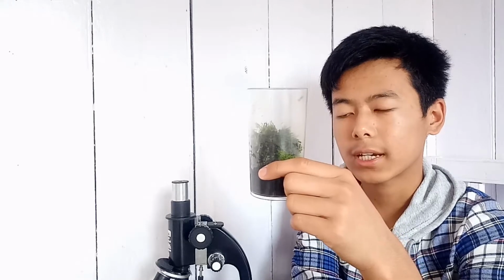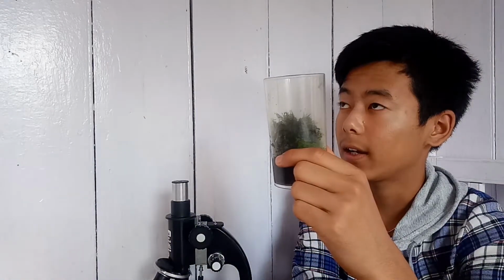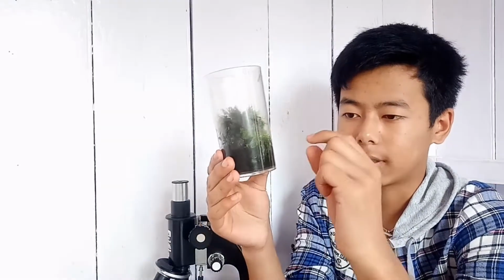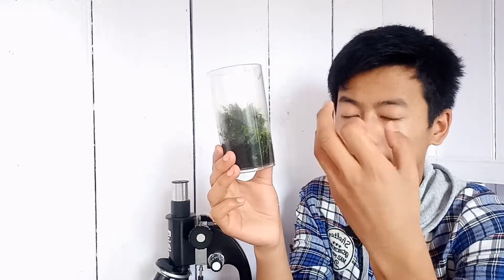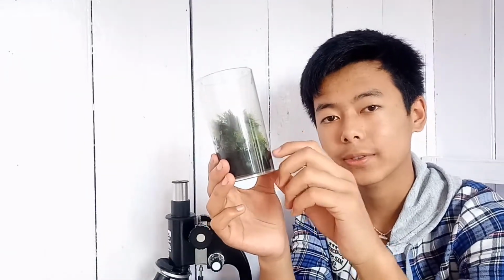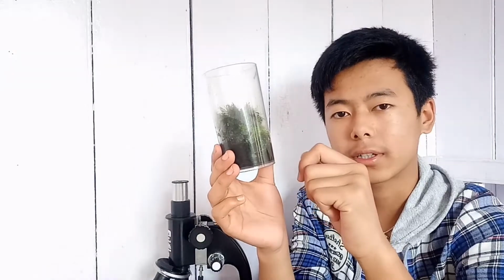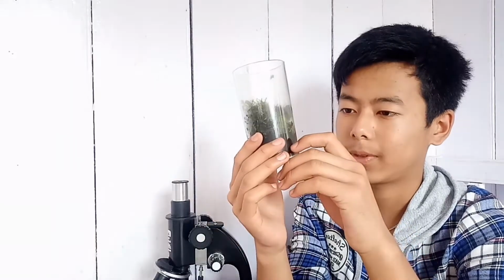So friends, in this video actually I'm going to show you something old. So this is an old specimen of moss which I had rehydrated. If I think back, I did this a couple of days before. So when I checked this water sample, it was filled with ciliates. It happened as if I had cultured those ciliates. They were uncountable ciliates, and I also found an aeolosoma worm in this water sample. So I recorded that video yesterday, so I'm going to show you that video, how it was.